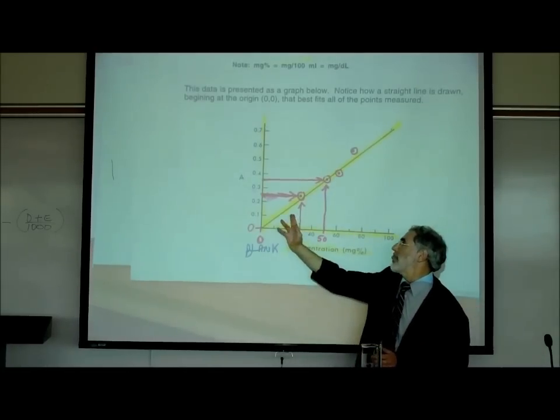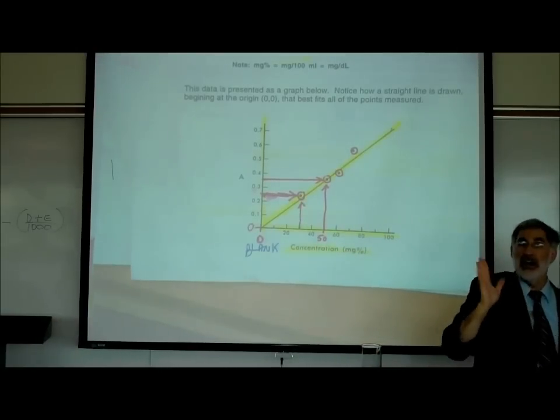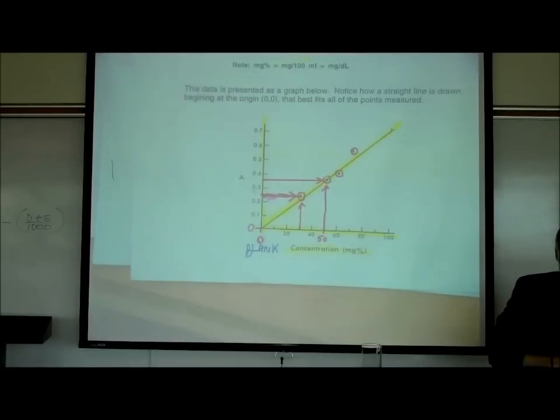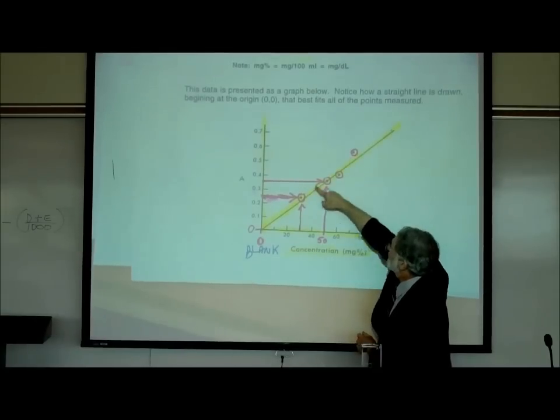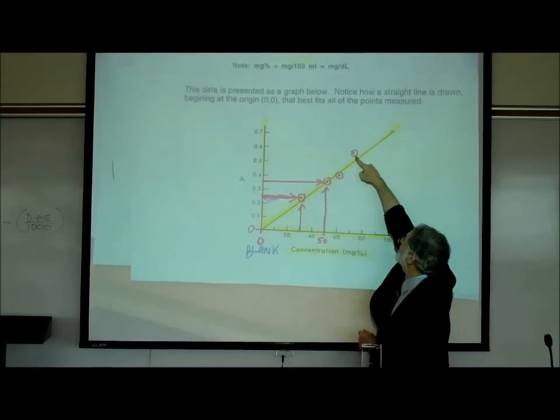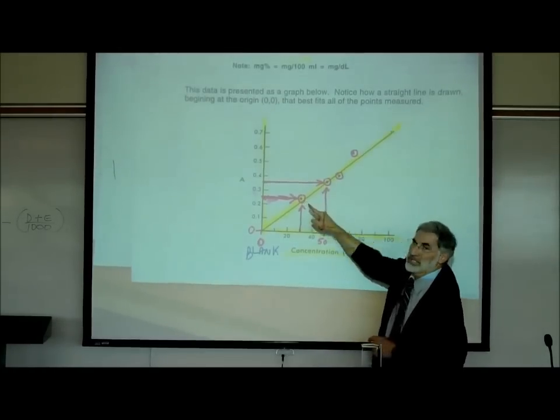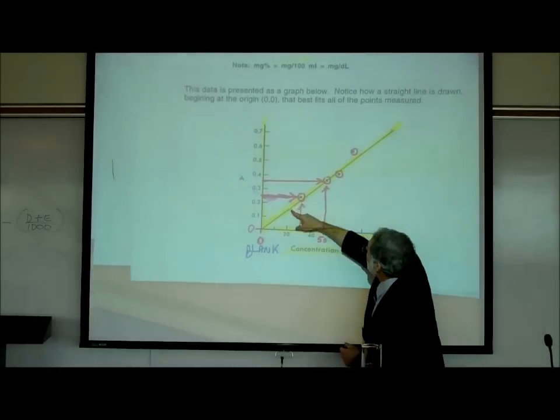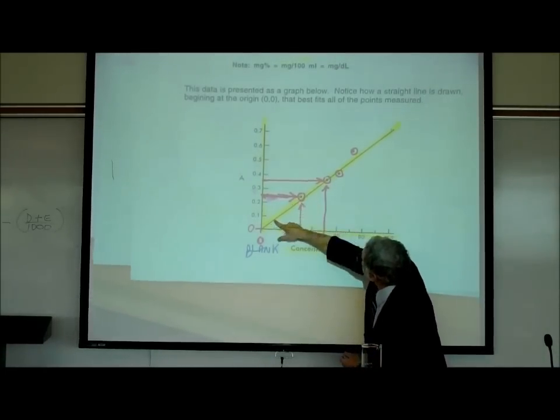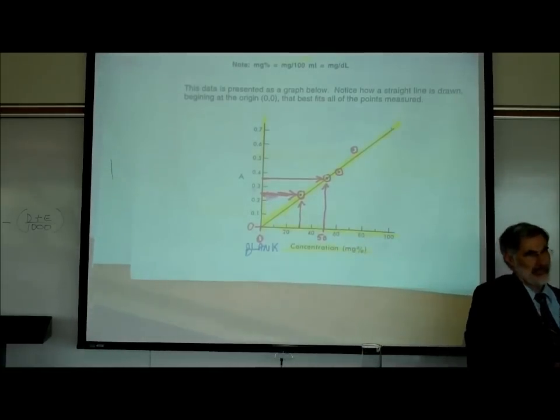What we do is try to make our line go as close as we can to all the data points. This point was not ignored. That line still has to be as close as possible to that point while still being close to this point. You might have said, let's draw this line so it goes through 2 of these points perfectly. That's not how we draw.